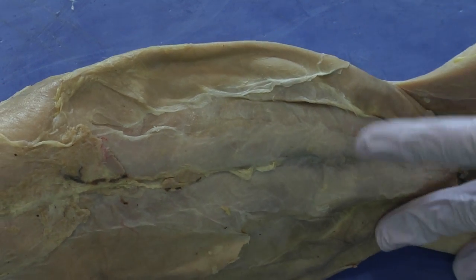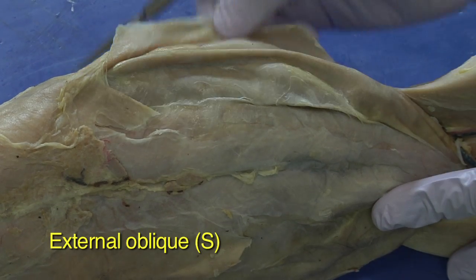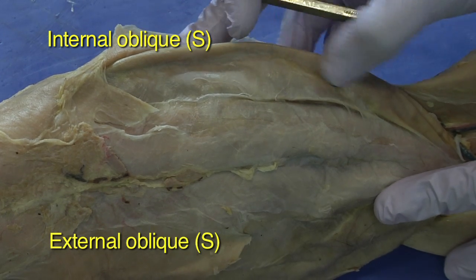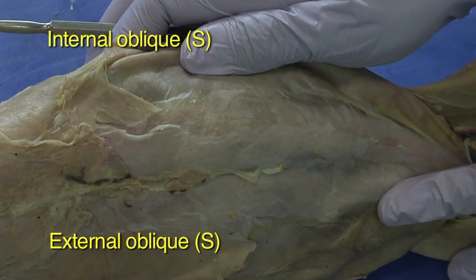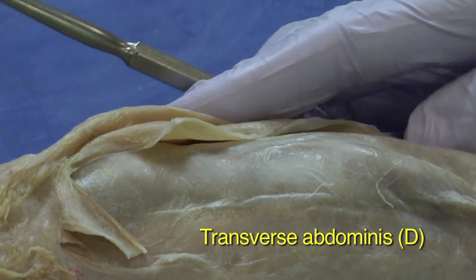And then continuing on, you have the obliques. So you have the external oblique, underneath that is the internal oblique, and then you'll have to look really closely to see the transverse abdominus.